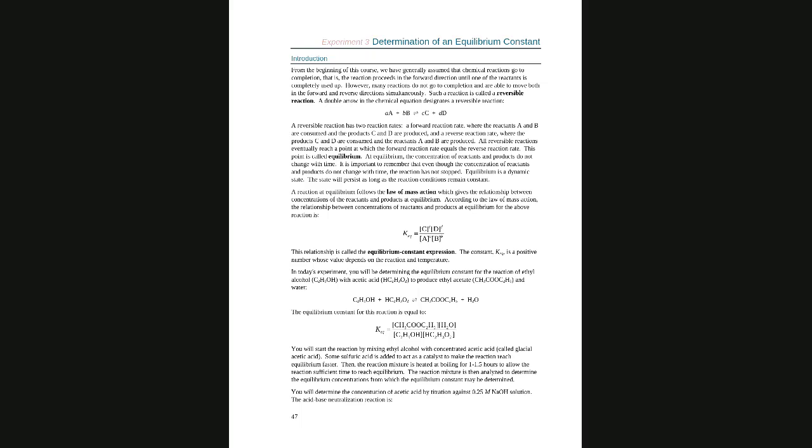When you think, oh, I cannot finish it, it doesn't matter. It will save automatically. Once you open it again, you will have the same data, and whatever you did is going to be there. The point is that they are not going to change the data, so you will always have the same.